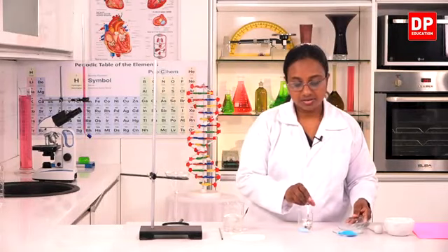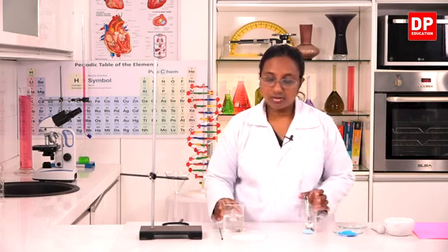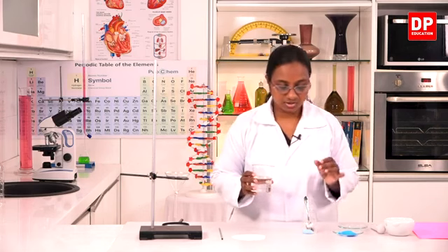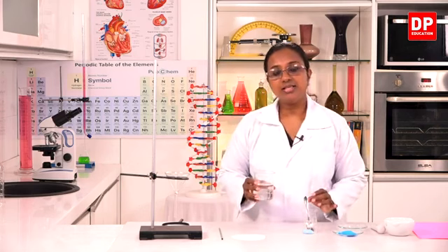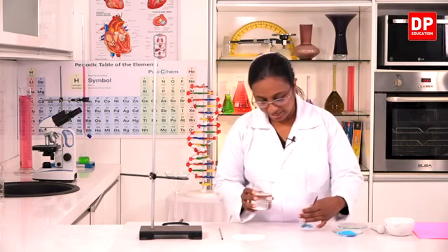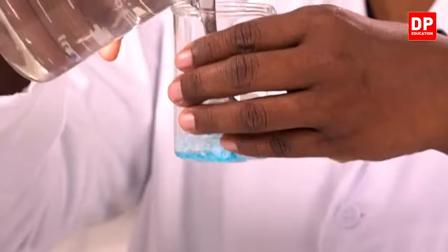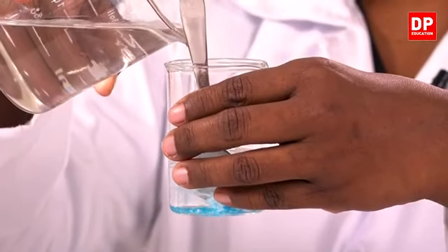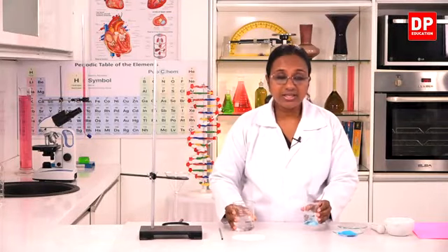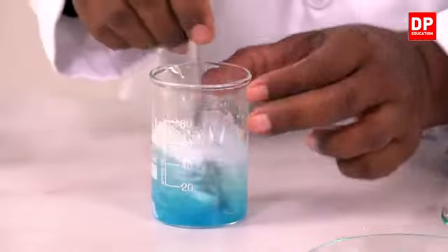Now that I have transferred all the solid into the beaker, I will add about 50 milliliters of water. As you can see, this is a 100 centimeter cube beaker, a small beaker. To that, I will add about 50 milliliters of water. This is not a quantitative activity, so we don't have to measure the volume exactly.